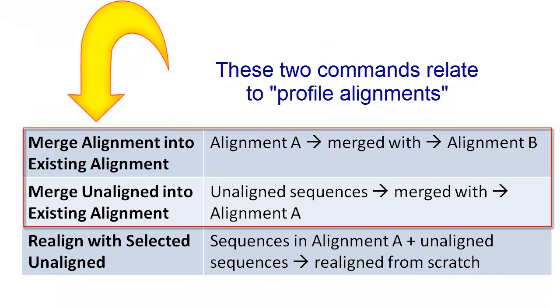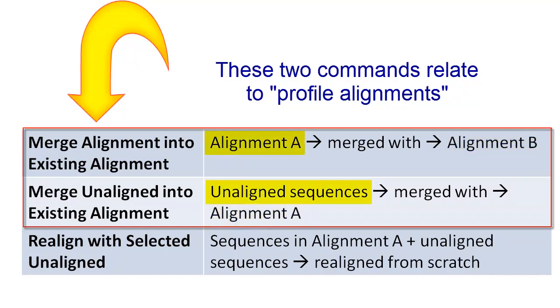Profile alignments begin with at least one finished alignment, and existing gaps are not removed from it before merging in additional data. However, new gaps may be inserted automatically to reconcile the new alignment.